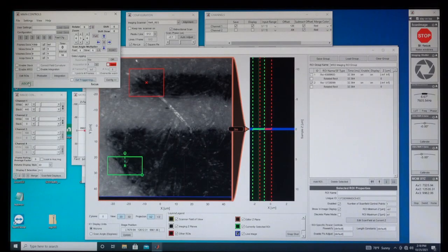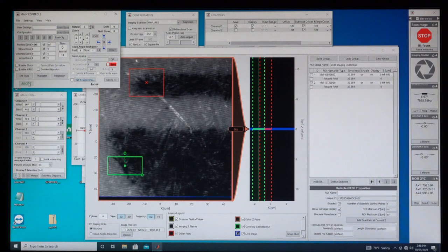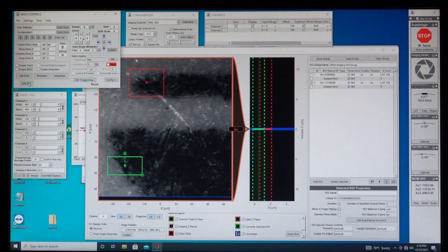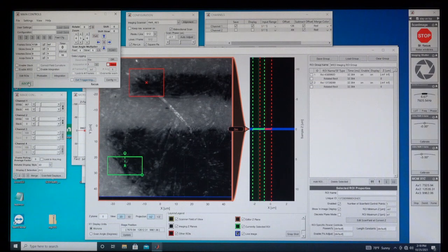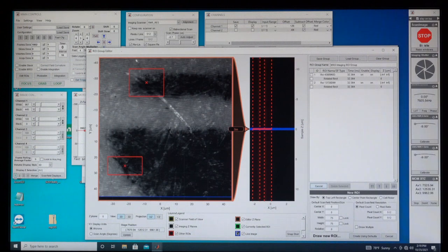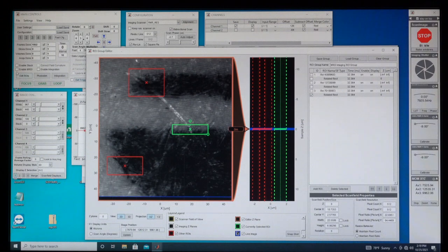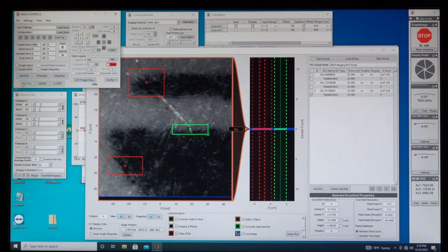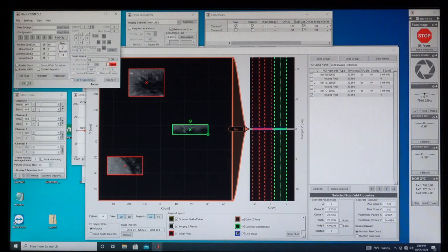This shows one functionality of the RGG scan box. We are imaging the entire field of view using the RNG scanners. I've selected two regions of interest already, and I will stop scanning and add a third. Now I select regions of interest scanning and press focus to begin scanning. Now you can see that not the entire field, but just the regions of interest are being scanned. And in this case, by the RGG scanners in concert.